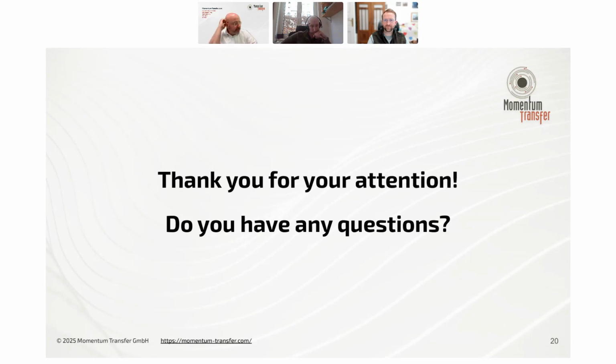All right. For your synchrotron samples analysis service, do you have customers from the US? Is it easy to ship your samples from the US? Can you work with air-sensitive materials? So the first two questions I can answer, yes and yes. It is easy to ship from the US, and we have plenty of users from the US. Just follow the process, and you will get a proforma invoice to lay into this package, and then customs is usually happy.